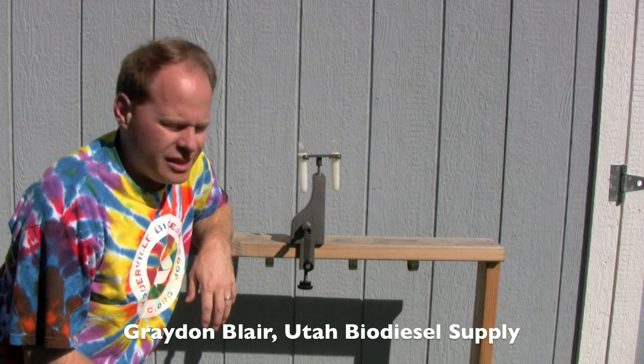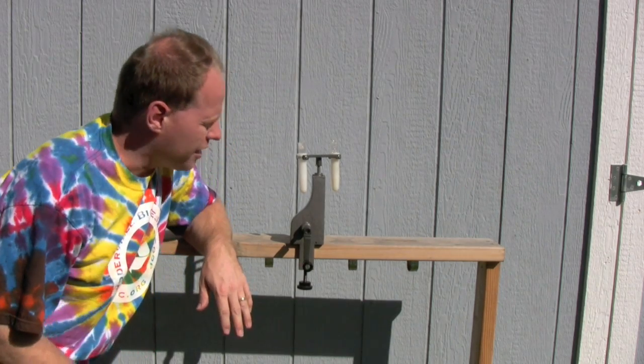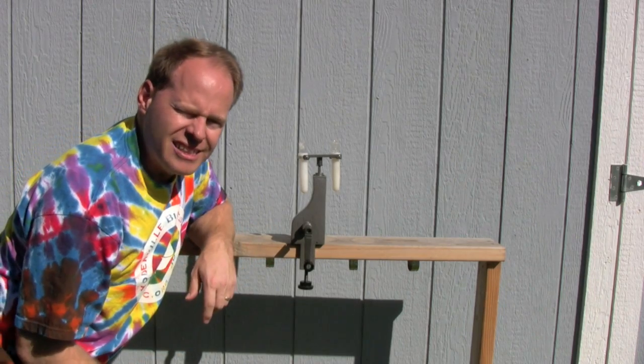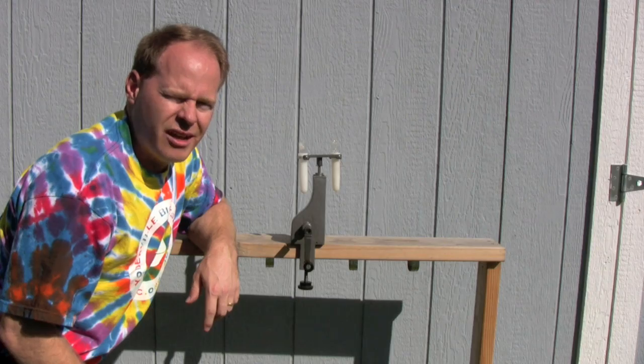Today we're going to show you a new product called the Whirlybird hand-operated centrifuge. This is a cool product because it allows you to take vegetable oil samples or samples of biodiesel and centrifuge them very quickly in this convenient little centrifuge. So we'll get to showing you how it works.